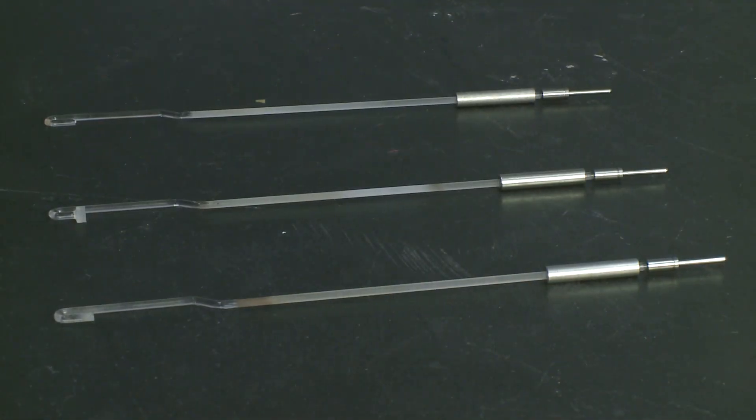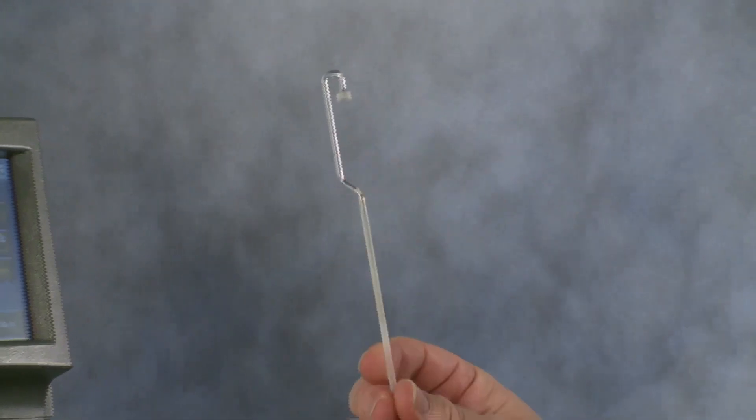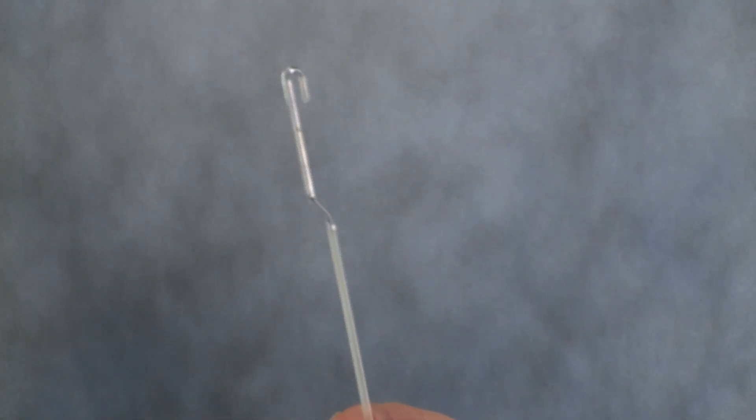We have three major probes. The expansion probe for CTE determination — it's flat. We have the macro expansion probe, which is also flat but with a higher surface area for softer materials. And we have the penetration probe, also made in quartz, with a tip for softening point determination.